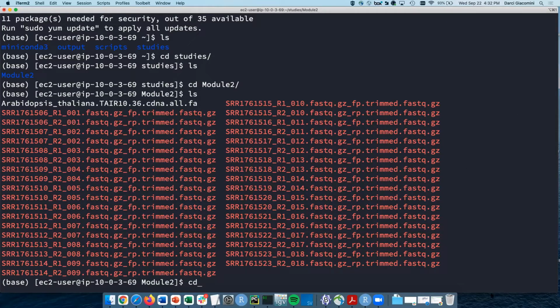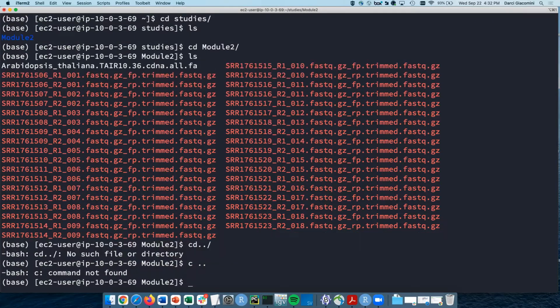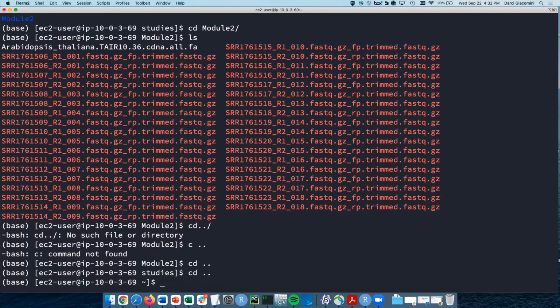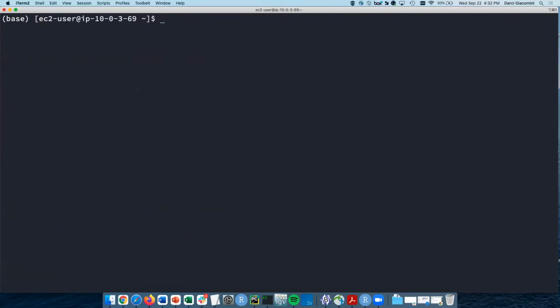There's no way to get rid of this. So yeah, just moving back up, maybe. How do I clear?